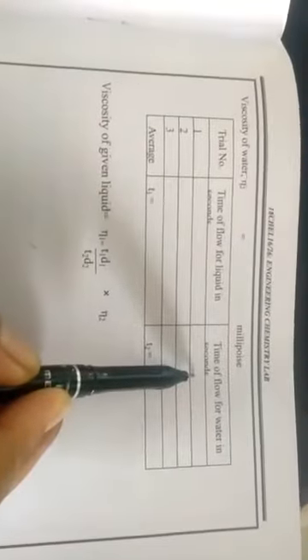Then here, as you know, we have recorded the time flow for the liquid in seconds. Whatever liquid is given, the time flow is recorded. Similarly, the time flow for water is also recorded. As you take it out from the oven, it should come back to room temperature. After it comes back to room temperature, using the same pipette, you should not change the viscometer nor the pipette. Pipette out 10 ml into the same viscometer and find out the time required by water. That you will be recording here. So this is the experimental data that you record after doing the experiment.